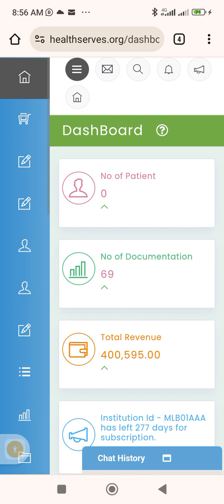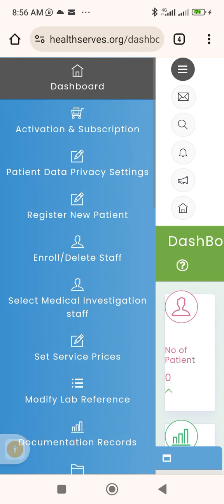What it will do is that it will expand this menu you have by the side, so you can see what functions they hold on each of the icons you're seeing. So I touch it, you can see it has expanded.